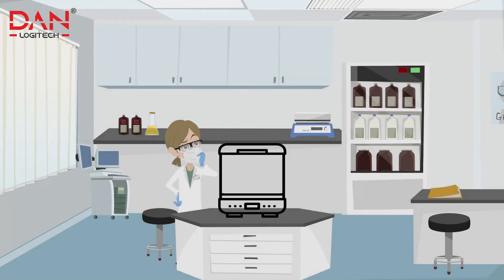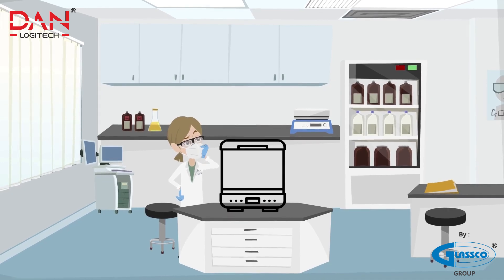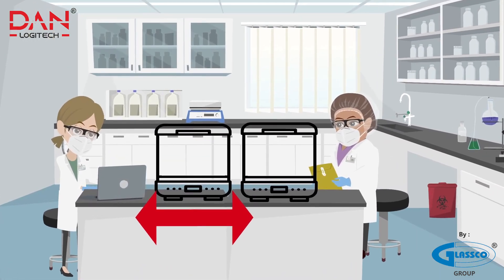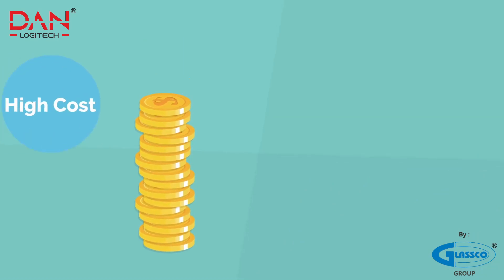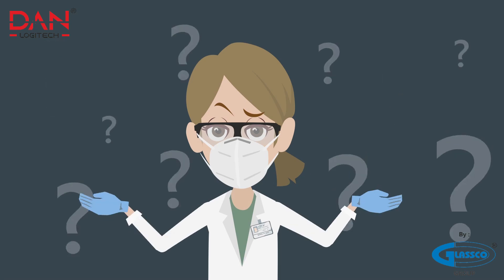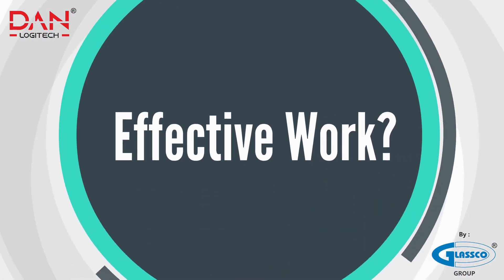Many challenges are faced with a standard incubation shaker. It occupies a lot of space and requires two drivers to operate them separately. Two different instruments cost you a lot and involve more maintenance. Are you facing such challenges? Do you want effective work, saving time and money?